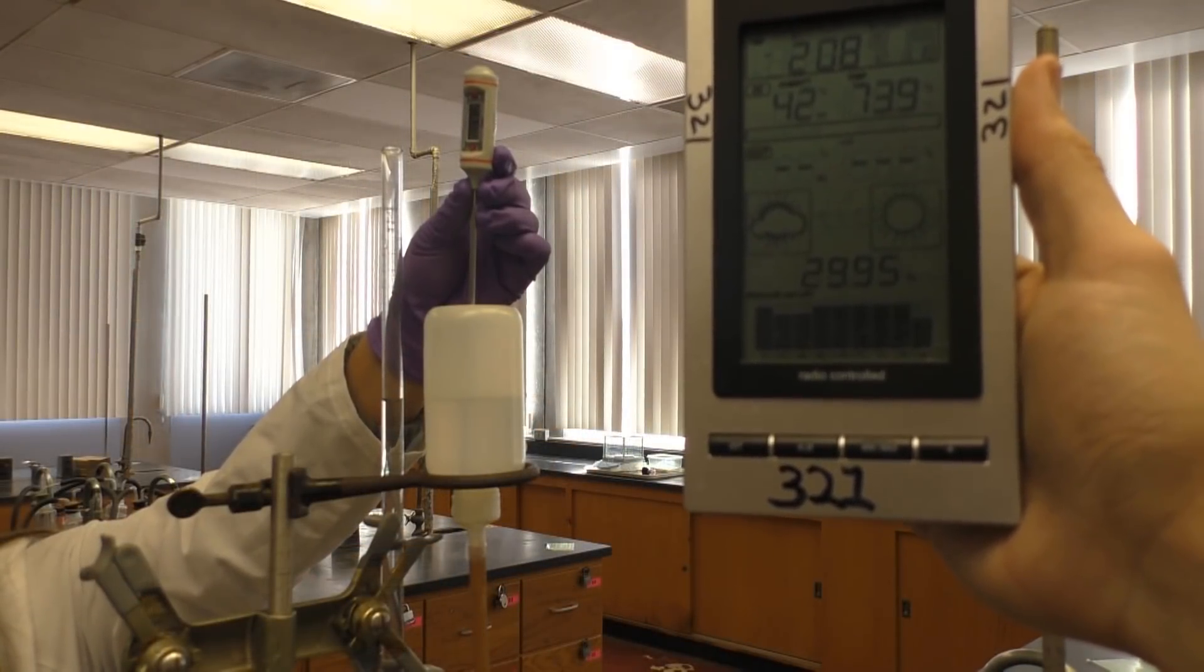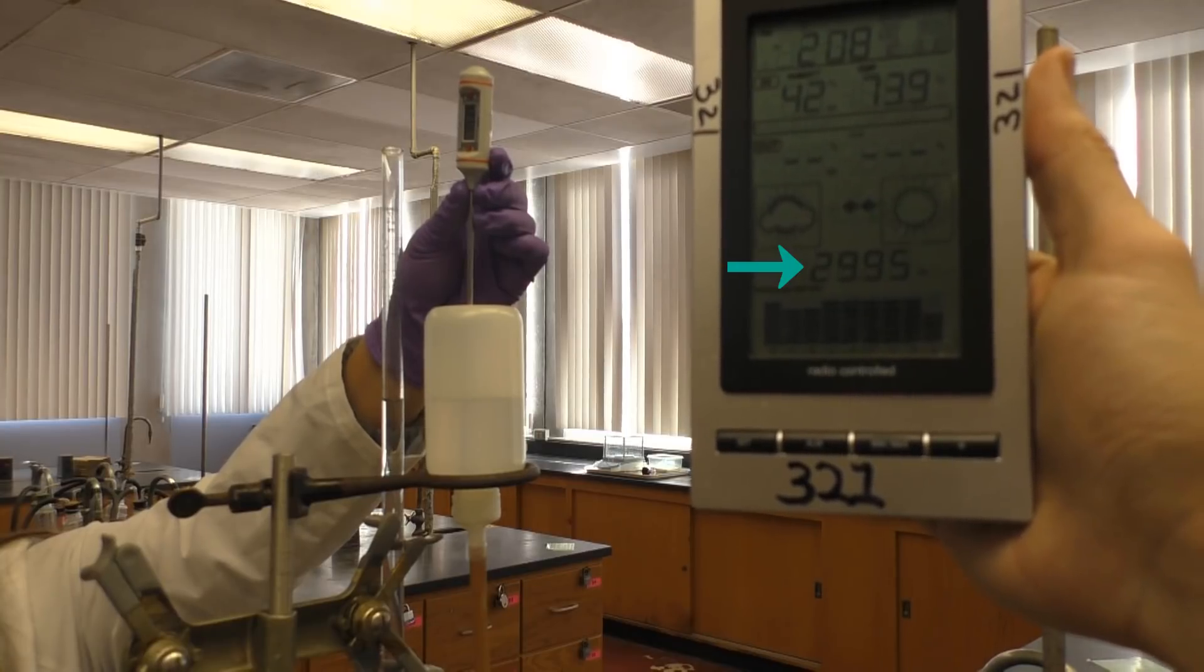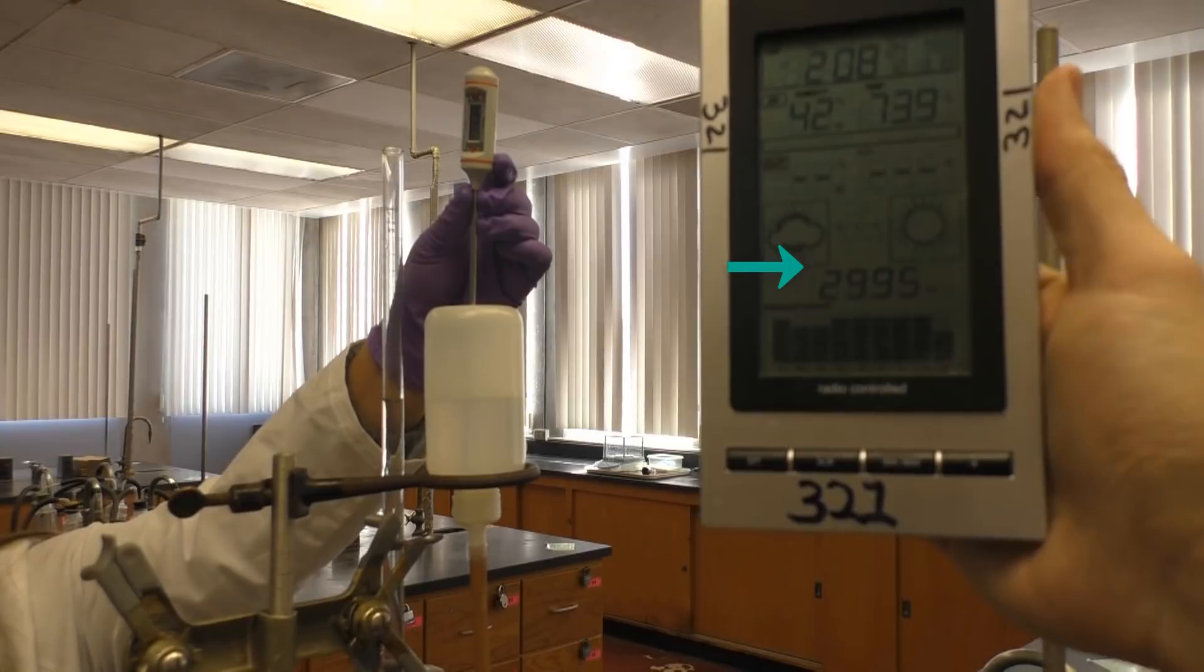Once you've removed all possible air bubbles from your system, take the temperature of the water in your leveling bulb and write it down. While you're at it, also write down the atmospheric pressure of the room. This will be provided by your instructor or can be found on the device in the front of the room.